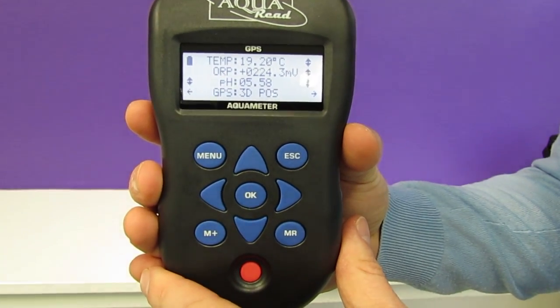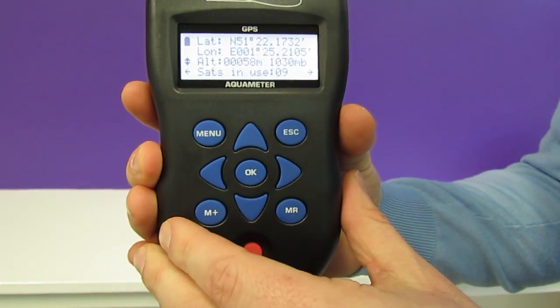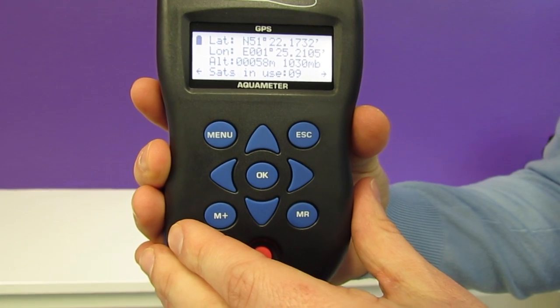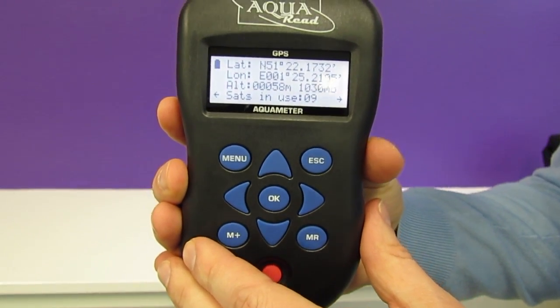We can see here on the screen that we currently have a 3D GPS position. If we scroll to the left we can see the lat long coordinates and we can also see the air pressure, because the GPS Aquameter has a built-in pressure sensor. It will also tell us how many satellites are currently being used.